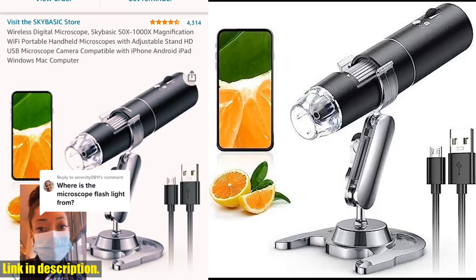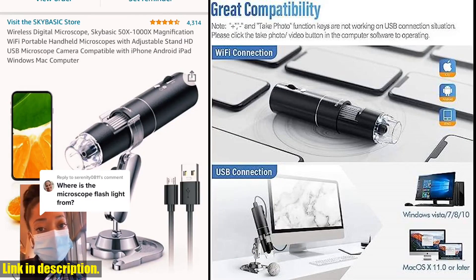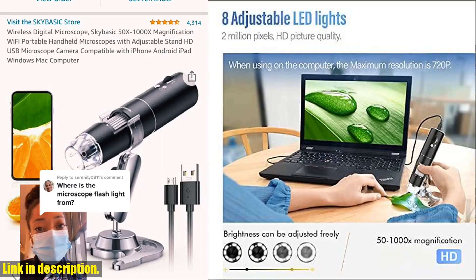Whether you're using it for studying plants, minerals, insects, or just for fun outdoor activities, this portable microscope is the perfect companion.